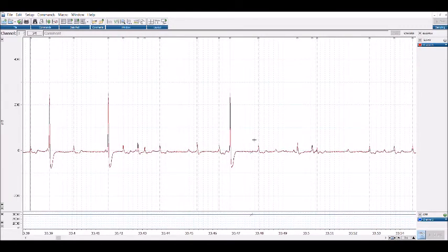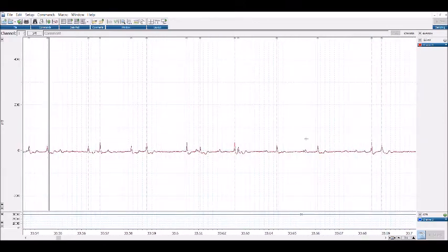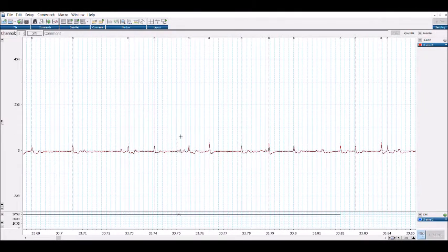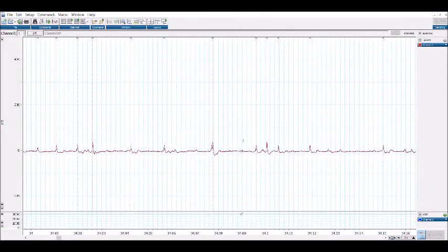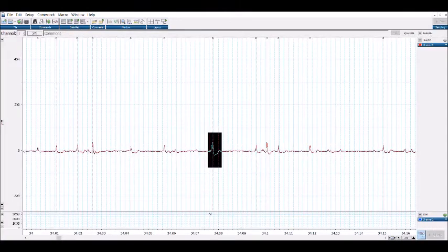These two. There's this one here, one here. There's this one right here. If you're unsure, you can highlight it and then hit this zoom at the top and it'll show you. You can see it big, like there's one right here. And then go back to the chart view.